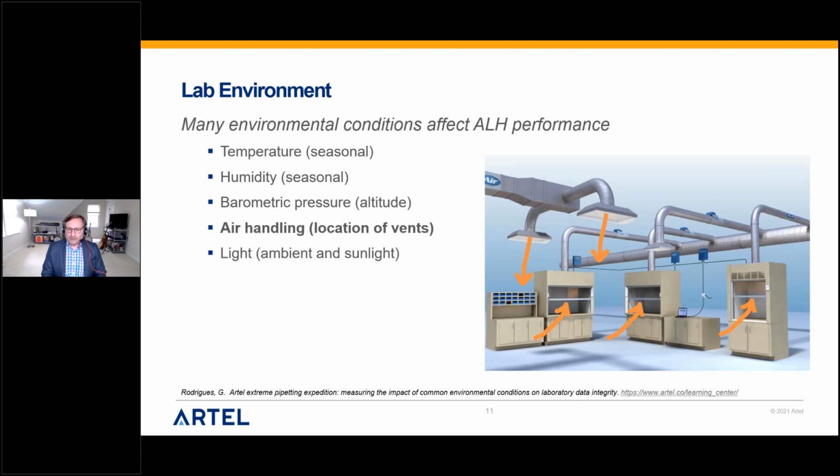When you think about air handling, I have just a diagram of a lab. There are the vents up above, blowing air in. That's what's doing the cooling and heating. And then some labs are also set up with chemical fume hoods, and these are taking the exhaust, pulling the air out. When you're setting up an automated liquid handler, you've really got to be aware of your surroundings, because these can have a dramatic impact on the performance.